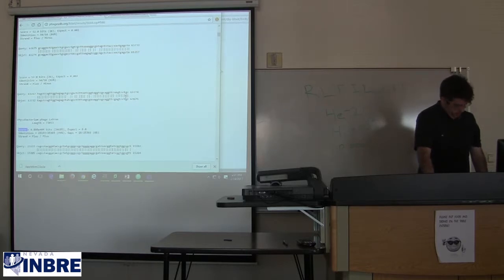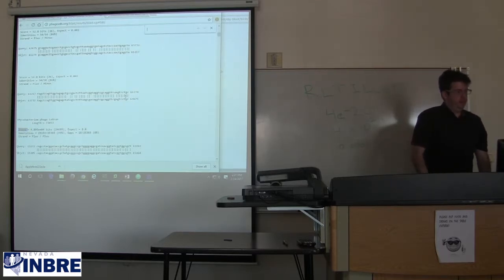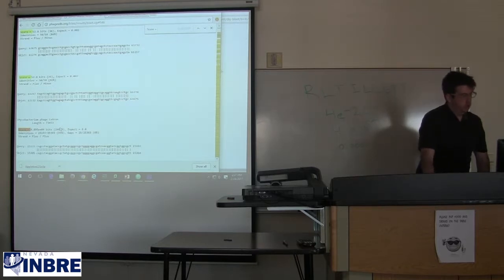And the trick should be to use the find function, which is Alt F, nope, Control F. And if we search for the word capital S score, space equals, space, we should be able to move down from the orange highlighted one here, score.